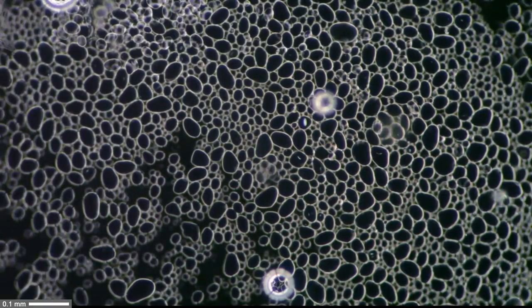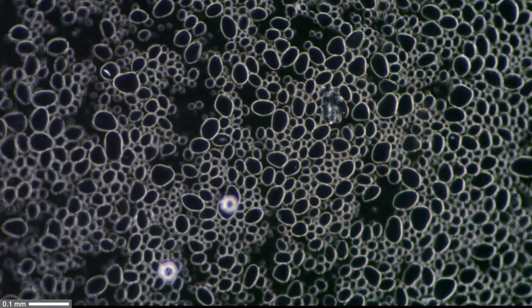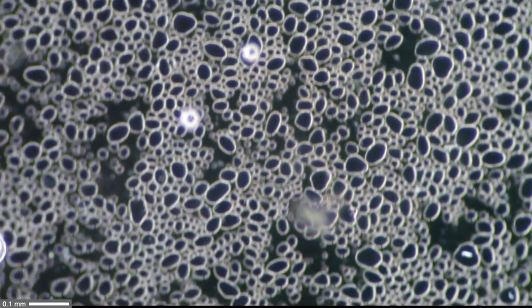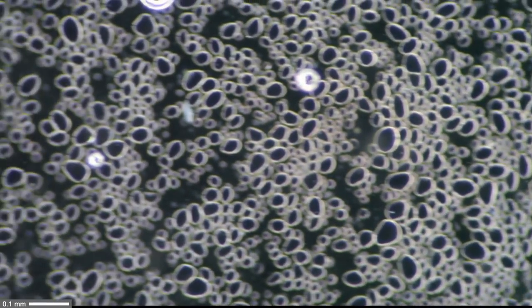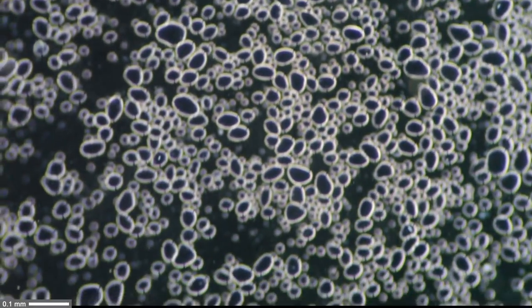Now that we have looked at the starch grains under polarized light, let's switch over to dark field. This here is now dark field so I added the dark field patch stop and put it into the filter holder. Now we can see the starch grains but they appear dark and the edges are white because this is where the light is diffracted.